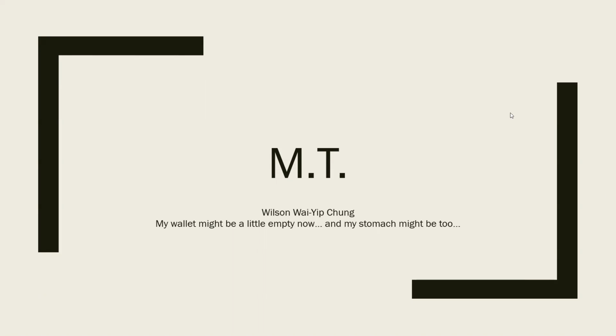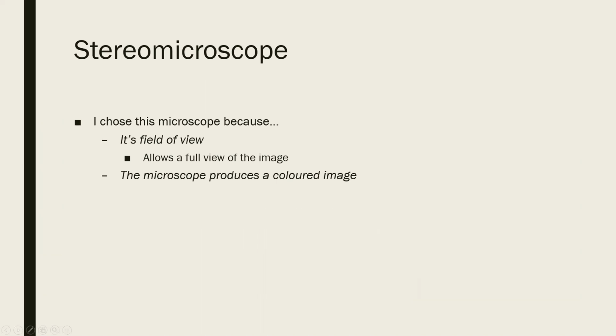But to continue with the presentation, I chose to use a stereo microscope for my masterpiece under the microscope, mostly because of its wide field of view, so I can get a full image of what I took an image of. The microscope also produces a colored image, which is very important to what I wanted to take a picture of, because I wanted something very colorful, very sort of magical. So I decided to choose something that could capture those colors.